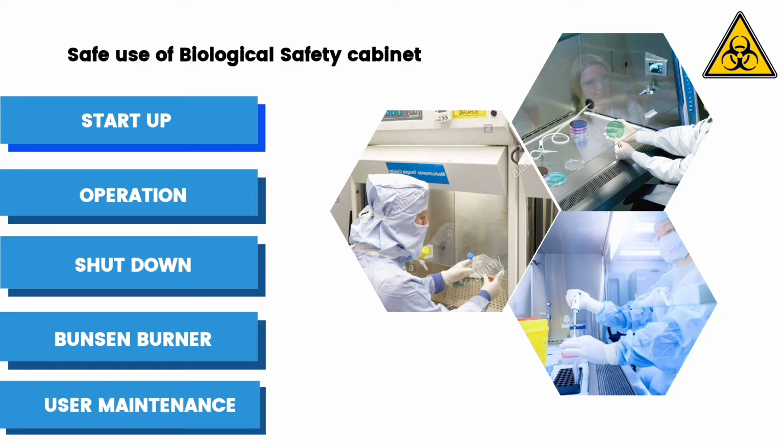Startup. Before starting the work, the biosafety cabinet, its workspace, side walls and glasses are properly cleaned with disinfectant solution or alcohol. Equipment should be switched on for 5 minutes before starting the work. This is done for decontamination of the cabinet.